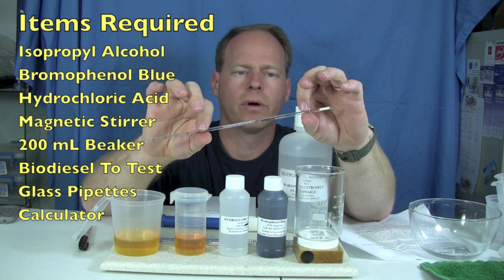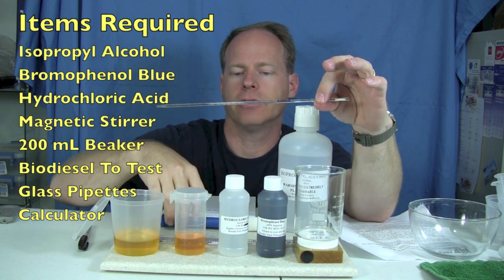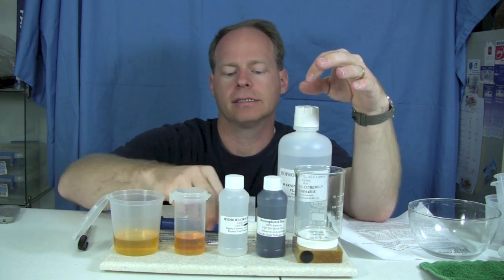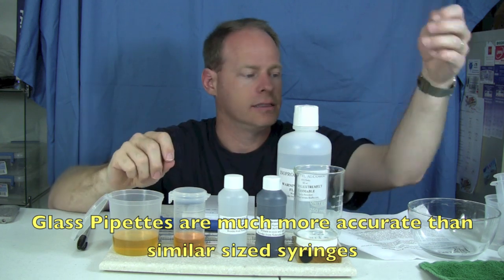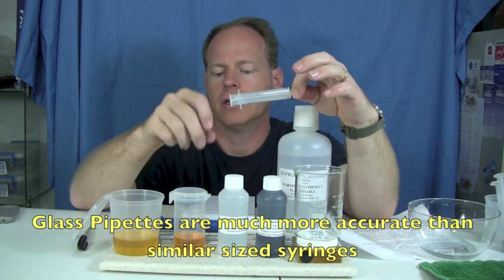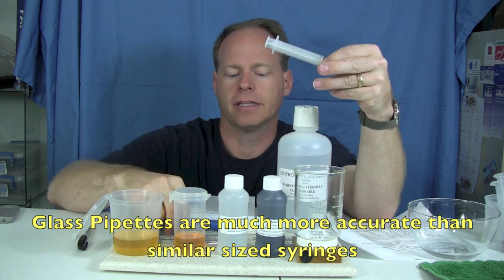This is a 0.01 milliliter marked pipette in glass and you use pipette pumps with it. I also have some bigger pipettes for measuring out biodiesel. They allow you to be much, much more accurate than using just a standard syringe. Syringes aren't anywhere near as accurate because these tubes are smaller and you're able to find the increments more easily.